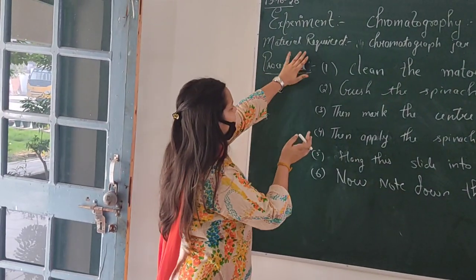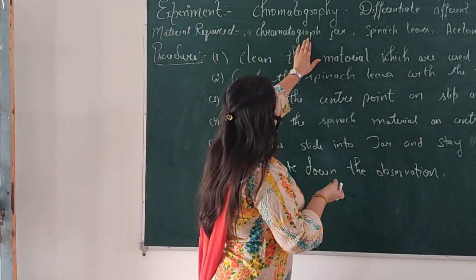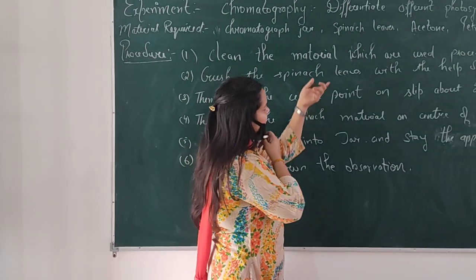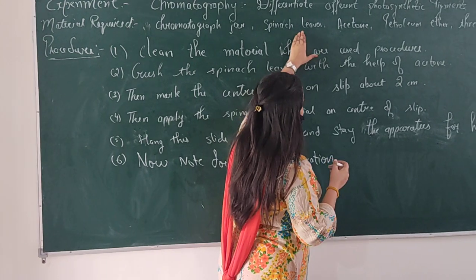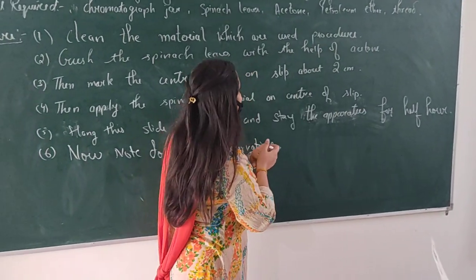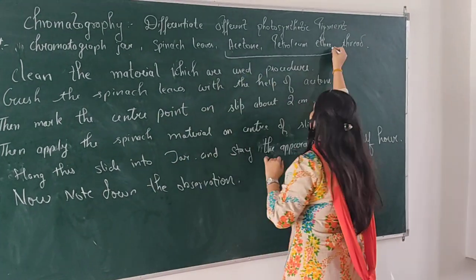Let us discuss the materials required. First of all, we need a chromatography jar. Then we need spinach leaves, acetone, petroleum ether, and strip. We also need the solvent — this is the solvent which we need.